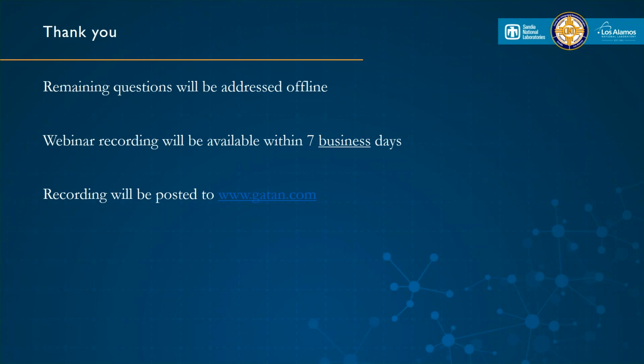Okay. Another question that came in: were the nanobeam electron diffraction strain mapping data also captured with the K3IS, and is the dynamic range of the camera good enough for this? I did not collect that data, so I hope I'm saying this correctly, but I believe the strain mapping was collected with the K3IS camera, and I believe that the range was good enough.